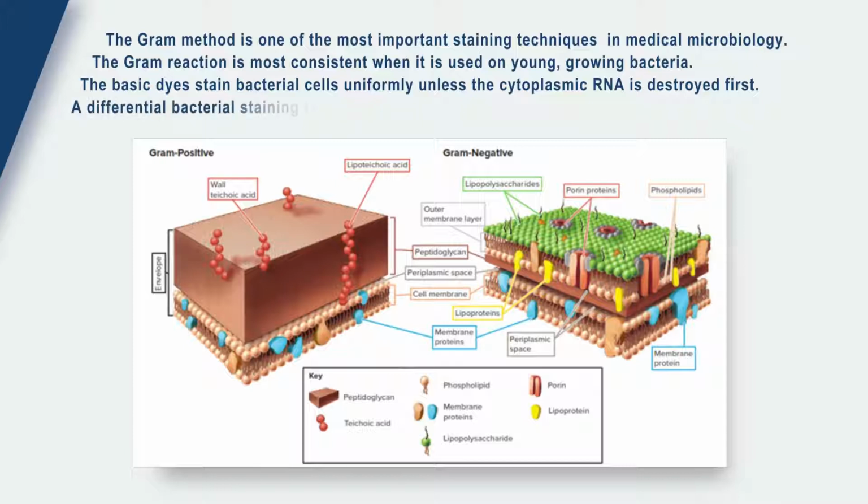In this video demonstration, we'll see a differential bacterial staining technique, gram staining. This protocol is used to differentiate and classify bacterial organisms into two large groups, gram-positive and gram-negative bacteria.